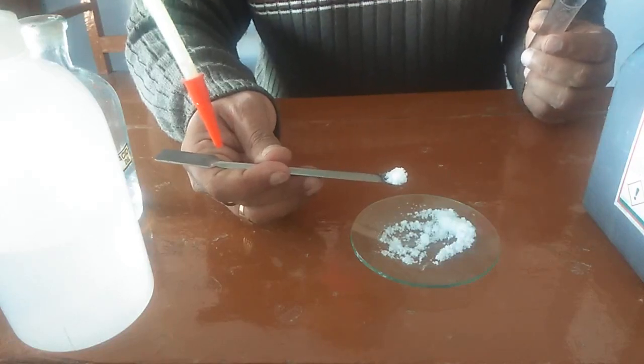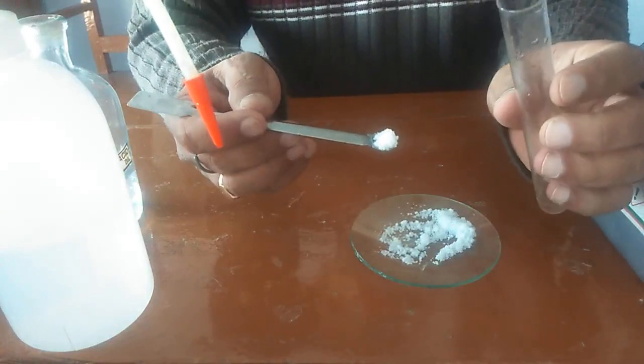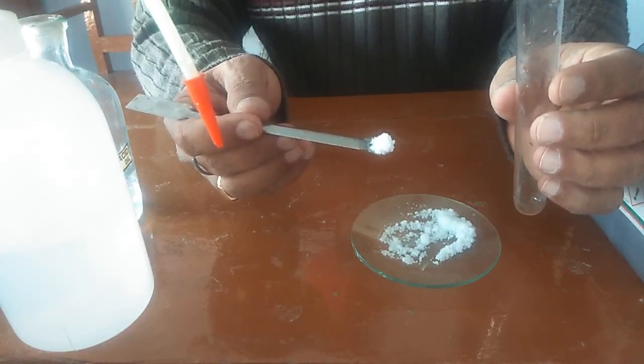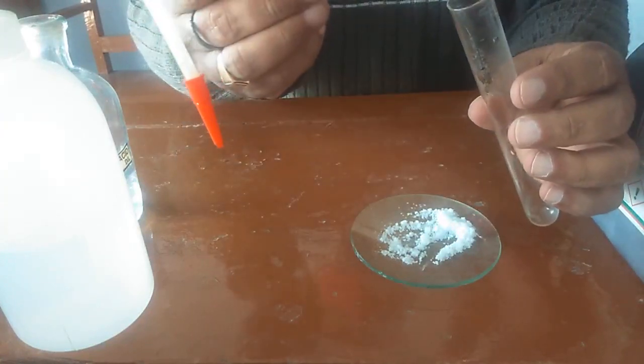Carbonate ion belongs to group 1 of acidic radical, and it can be tested with group 1 reagent, either dilute H2SO4 or dilute HCl. To test the presence of carbonate in a salt, we will do a preliminary test.